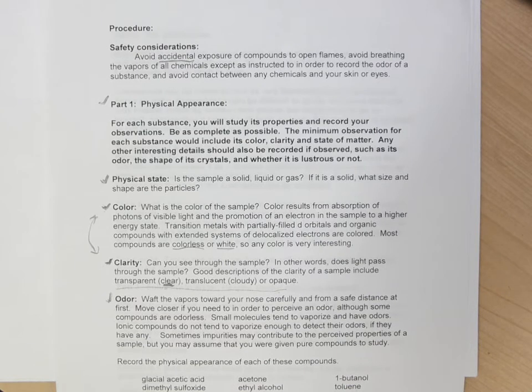How viscous the liquid is, if it's a thick liquid that resists flow, that's different than if it's not very viscous and flows easily. So this is something that the more observations the better, and the more descriptive you can be, the better it is for the people who are going to try to understand and follow your work.